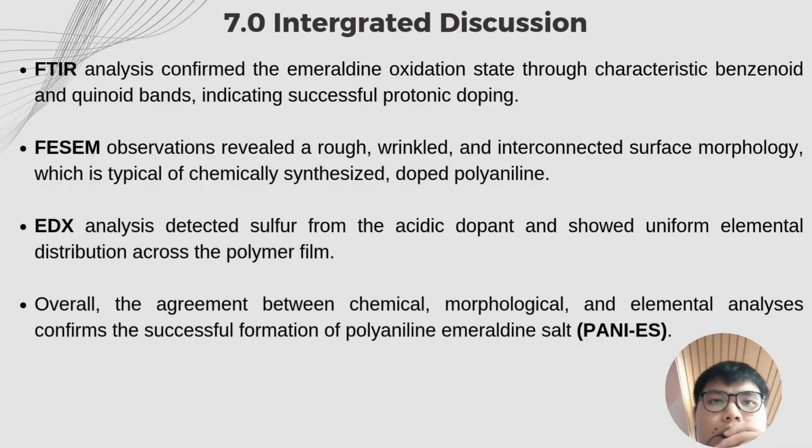For the integrated discussion, FTIR analysis confirmed the emeraldine oxidation state through characteristic benzenoid and quinoid bands, indicating successful protonic doping. FESEM observations revealed a rough, wrinkled, and interconnected surface morphology, which is typical of chemically synthesized doped polyaniline. EDX analysis also detected sulfur from the acidic dopant and showed uniform elemental distribution across the polymer film. Overall, the agreement between chemical, morphological, and elemental analysis confirms the successful formation of polyaniline emeraldine salt.